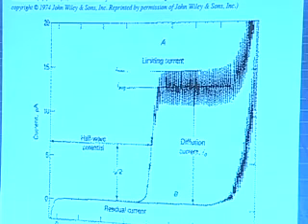That is, the current at the top here is a much larger current than you would see at a solid electrode under the same circumstances. Okay. So if your goal in life was looking at a very low concentration of something in solution, this would be an enhancement if you want to do analytical chemistry. Okay. Now, another way you can get that enhancement is instead of changing the mercury drop, you could change the potential, right?